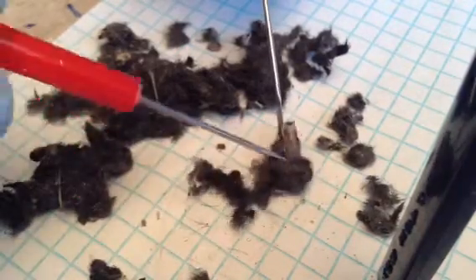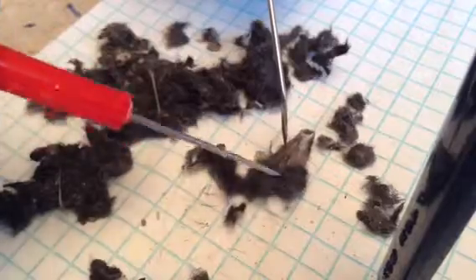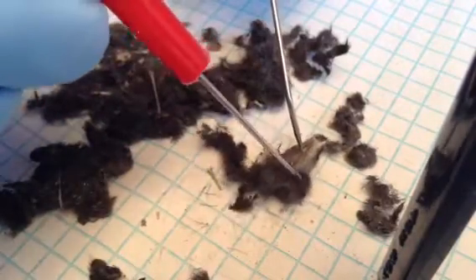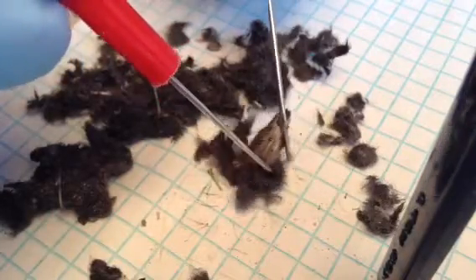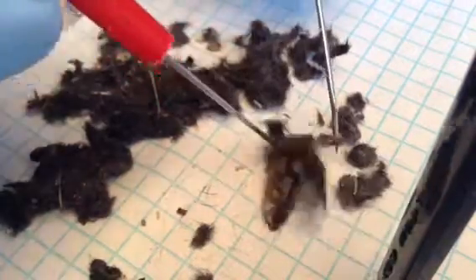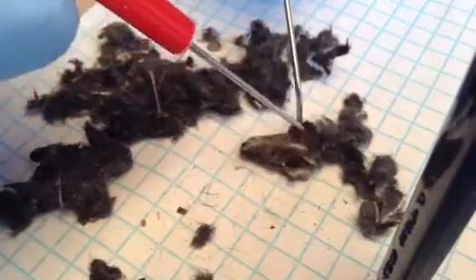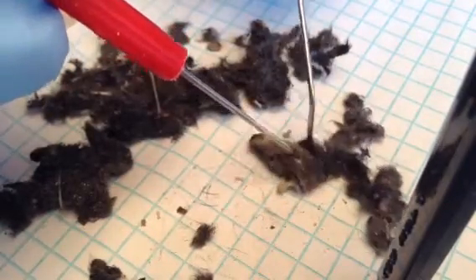But you think it's a vole? I think it might be a mouse. I don't know. Voles are a little bit more long — yeah, that might be a vole. Of course, this is only part of the pellet; there's probably going to be two other animals in there — I'm just guessing.